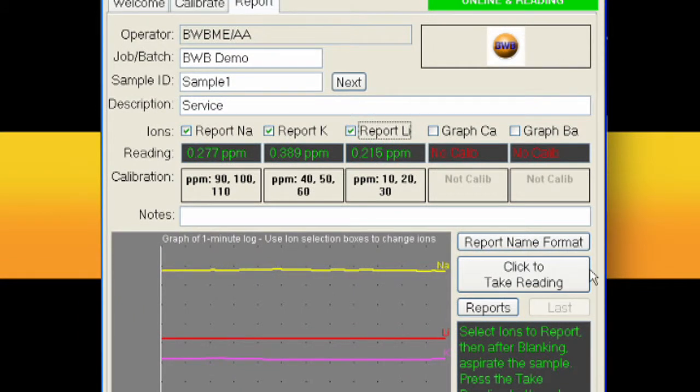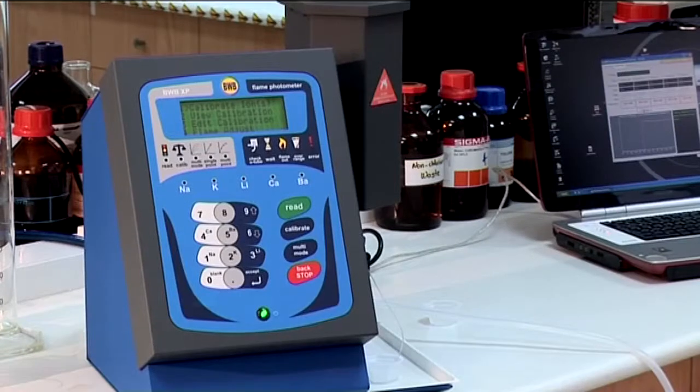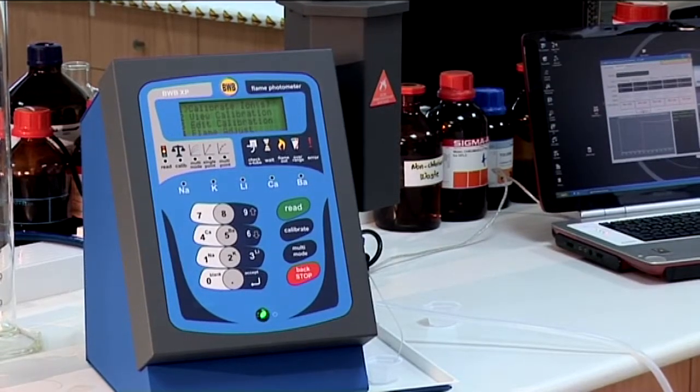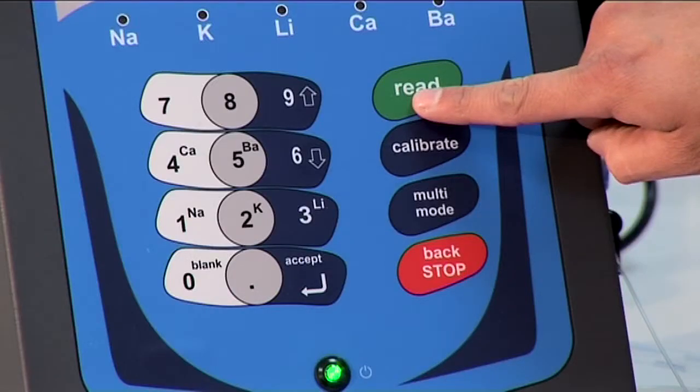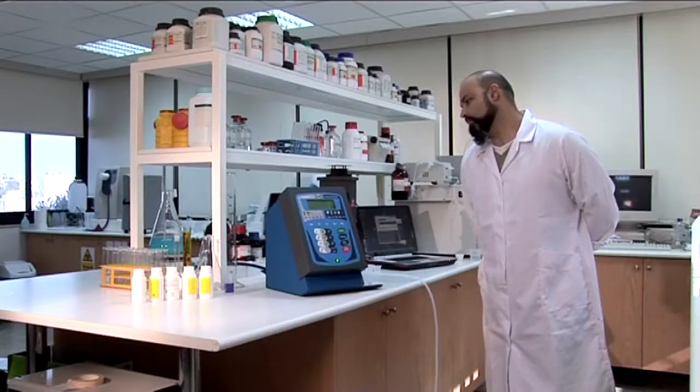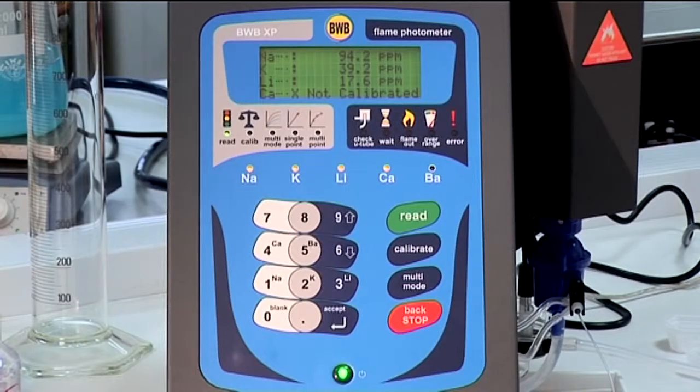Now go back to the BWB XP and take a reading. First of all press the accept key or read shortcut key and then aspirate your sample.